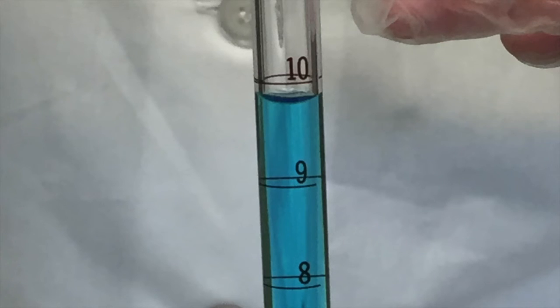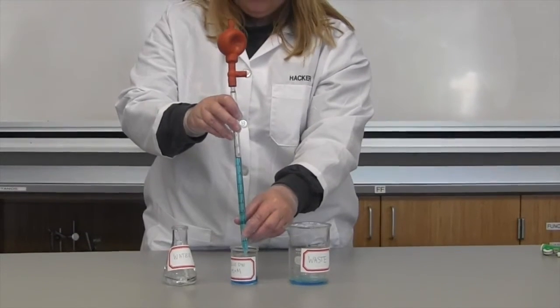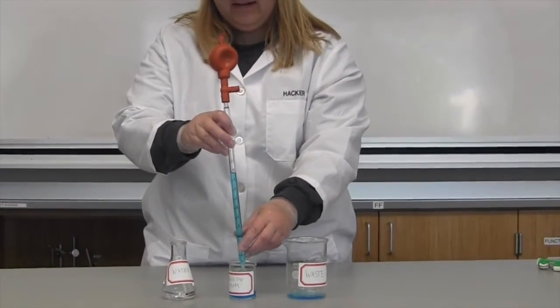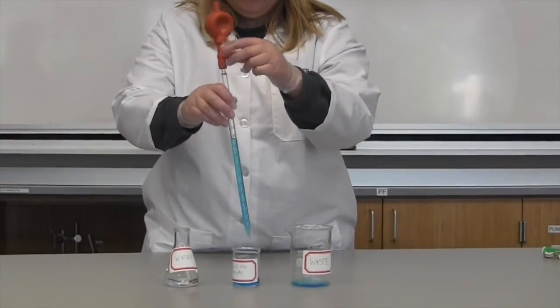Currently, it's at about 9.8 milliliters. Then, we move our pipette, keeping it vertical, to our new container and use the eject valve to dispense the liquid.